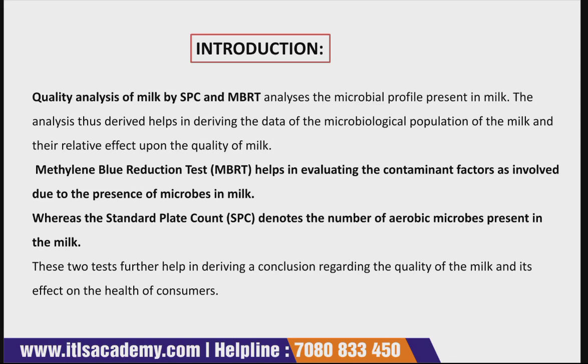The SPC, that is standard plate count, shows an average plate count of 30,000 in the toned milk found in India, and it reflects that the quality of toned milk is comparatively higher than that of regular milk available in the market.